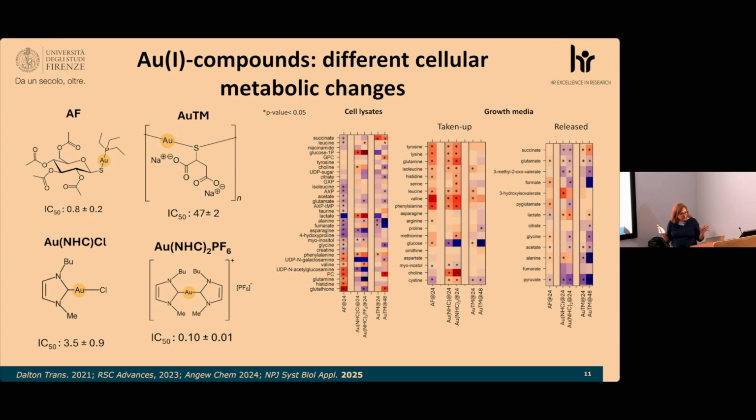Again, we are always working under equal toxicity conditions, so we use the IC50 value measured at 72 hours for each of them.